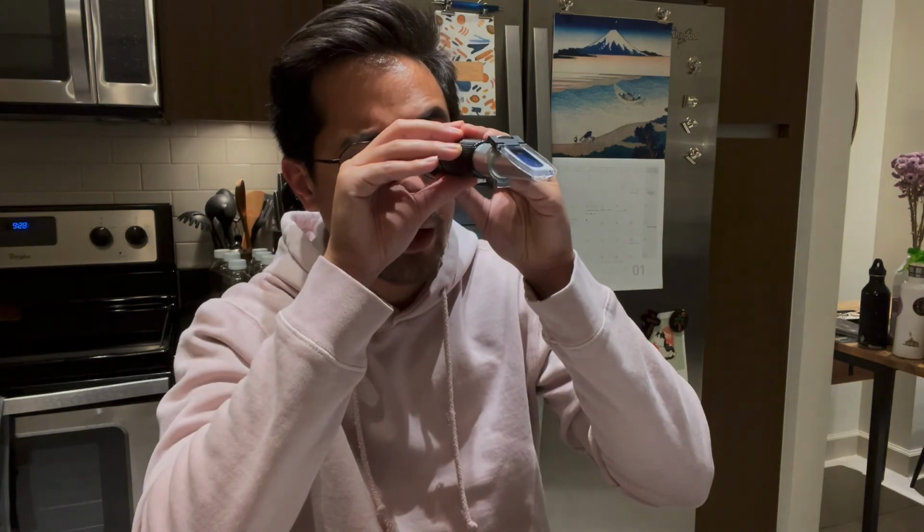2.4. That might be our lowest one so far. Interesting. So that's a lot lower Brix than what was showing for the regular 221 BC. I don't know if that's because some of the sugar actually tends to ferment out because it's being fermented longer.